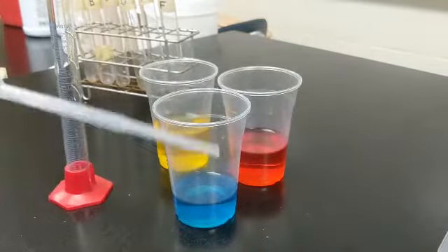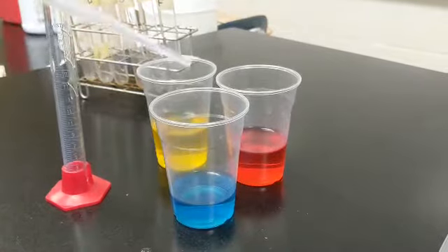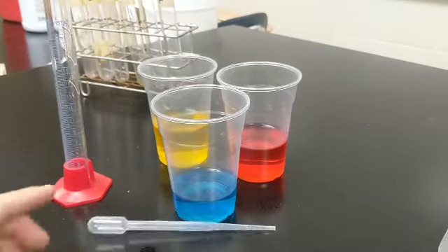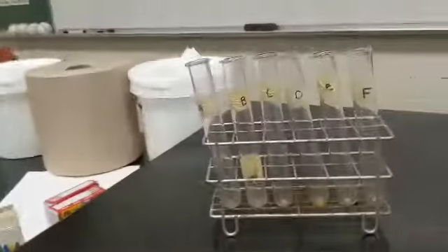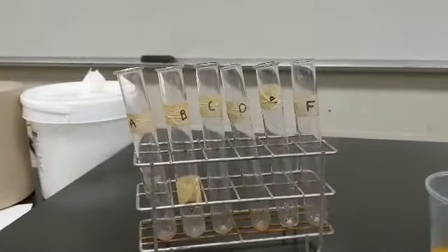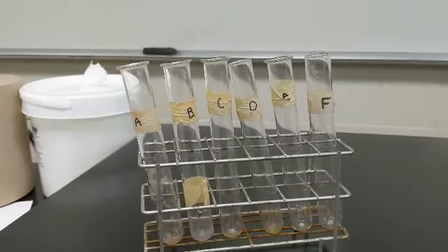We're going to use this to stir, and we're also going to use the pipette to get good, accurate measurements into the graduated cylinder. Graduated cylinder. And we've got our test tubes in our test tube rack. So we've got A, B, C, D, E, and F test tubes.